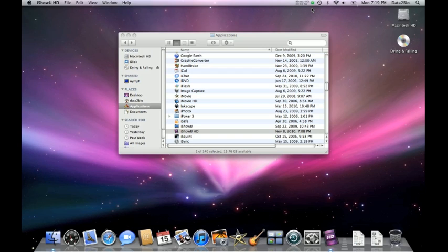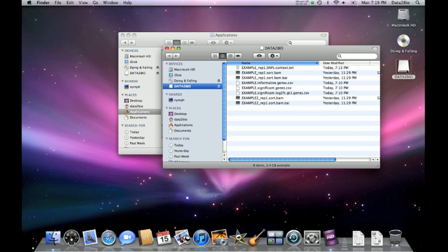what is going on. The first thing you're going to want to do is insert your flash drive and take a look at what is available in the report. There will probably actually be far more files than you see present here in your own analysis. I'm making this video as the report is still being finalized.